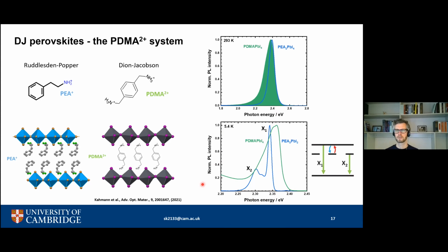I'm going to skip that discussion a bit today, but usually what I would like to highlight is that when explaining these transitions, we're usually referring or conceptualizing that as one semiconductor. And then there are some states in the semiconductor, for example, due to a biexciton or due to the triplet. It's one material. The PDMA, in contrast, does not show these narrow emission bands, really. It's all still very broad.